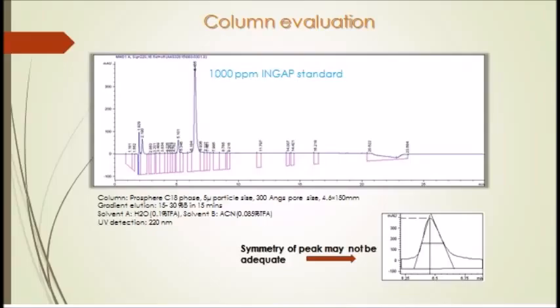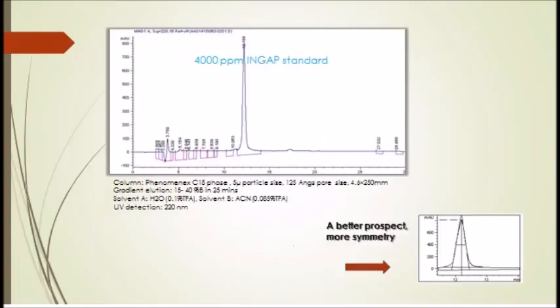From the integration report of this column, it has an acceptable peak width, yet symmetry is wanting, exhibiting a lesser downward slope called tailing. The integration report for this column indicated a more adequate peak width and symmetry. It does, though, indicate more of a lesser forward slope, which is called fronting.